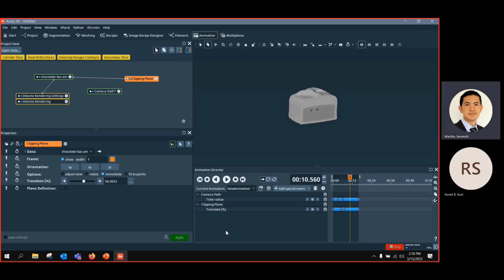Yeah, so when you have everything ready, all the combination, but it also needs a lot of planning, because if you want to do many animations, like first from a 2D slide, and then this 2D slide appears, disappears, and then appears with a 3D volume, you have to plan a bit before you do this animation, what comes first, what next, and in which step.